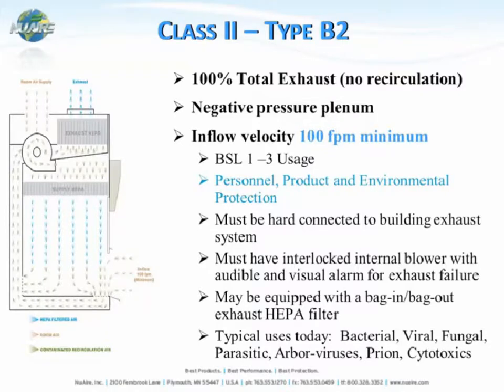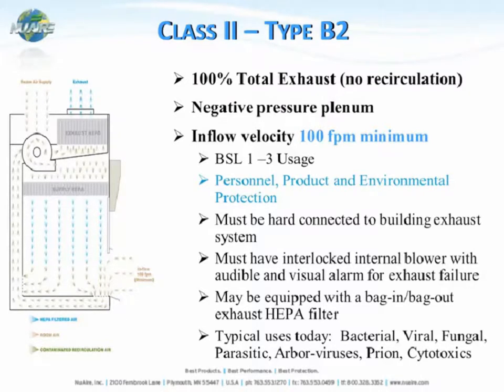From a Class II Type A2, we move to a Class II Type B cabinet, starting with the B2. This is 100% total exhaust — there's no recirculation within the cabinet like the Class II A1 and A2 cabinets. Because it's 100% total exhaust, Type B cabinets must be hard connected to the building exhaust system and must be interlocked with the internal blower with audible and visual alarms for exhaust failure. If there isn't sufficient exhaust flow, the cabinet itself will also shut down to guard against pressurizing the exhaust ductwork within the facility.